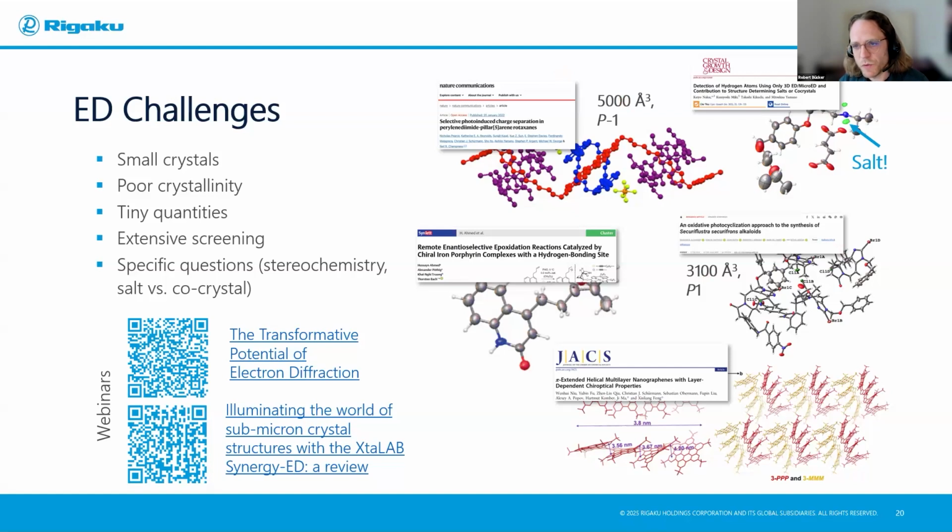This is an interesting one, which highlighted in a pharmaceutical compound that you can quite easily distinguish salts and co-crystals by accurately locating hydrogen atoms due to these different scattering properties, due to this electrostatic potential versus electron density story, which makes hydrogens more visible. You can confidently assign an absolute structure, and you can also really get to cope with really tricky stuff like these low-dimensional graphene structures, which are really just too sensitive and too small to be solved with X-rays.